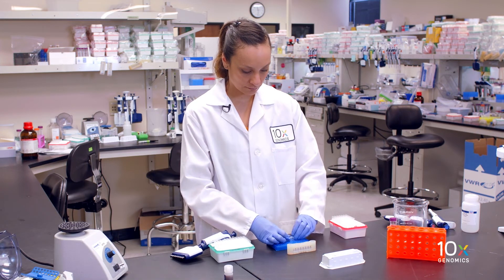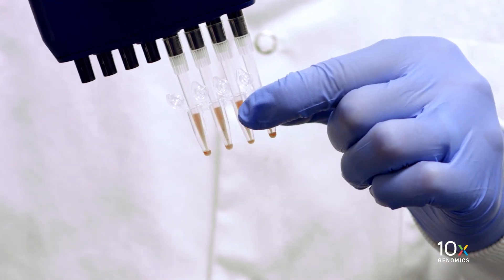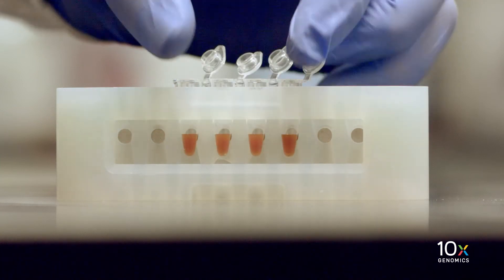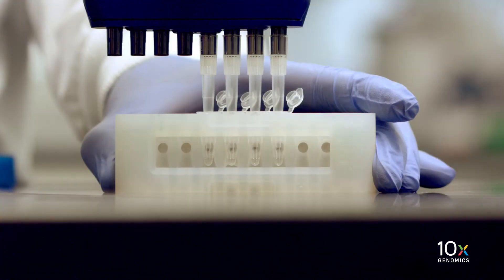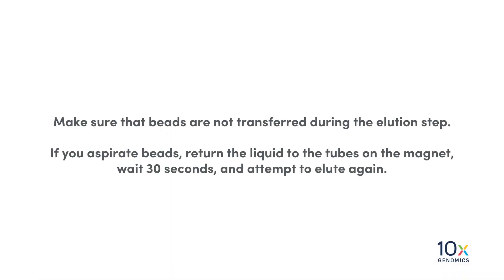Remove the tube strip from the 10x magnetic separator. Add buffer EB, pipette mix 15 times, and incubate at room temperature for 2 minutes. After 2 minutes, place the tube strip in a magnetic separator in the high position until the solution clears. Transfer 40 microliters of sample to a new tube strip and cap the tubes. Make sure that beads are not transferred during the elution step. If you aspirate beads, return the liquid to the tubes on the magnet, wait 30 seconds, and attempt to elute again.